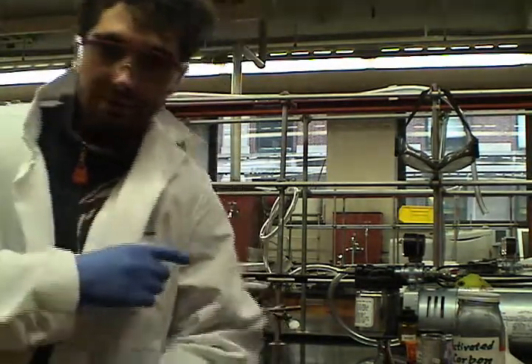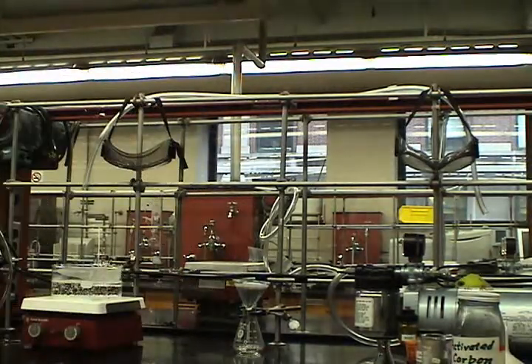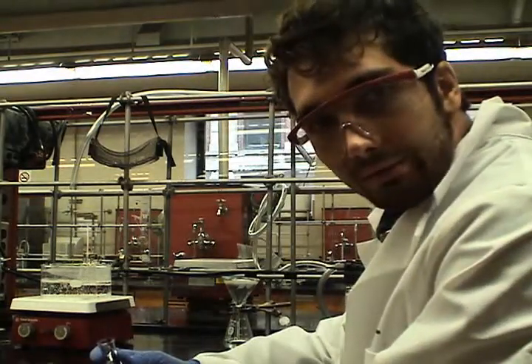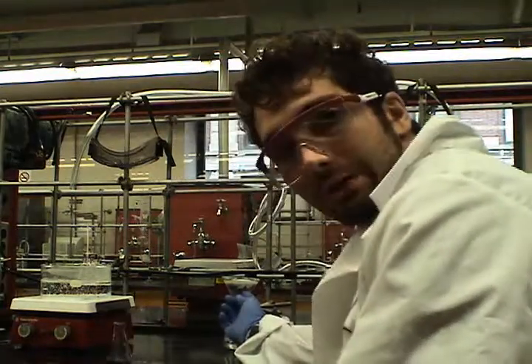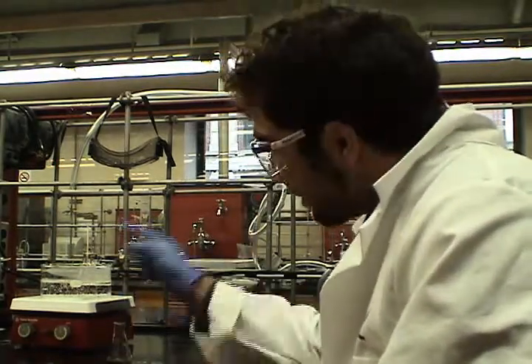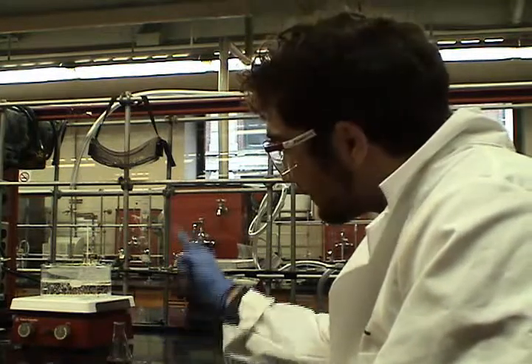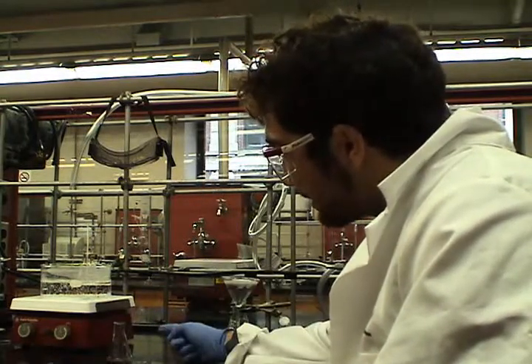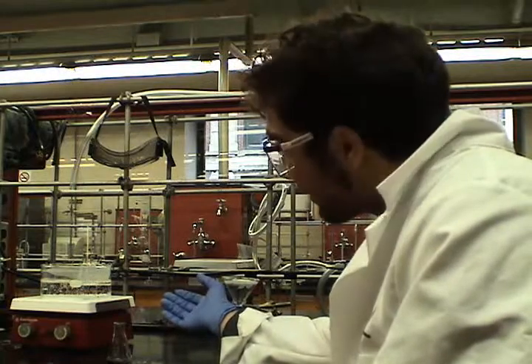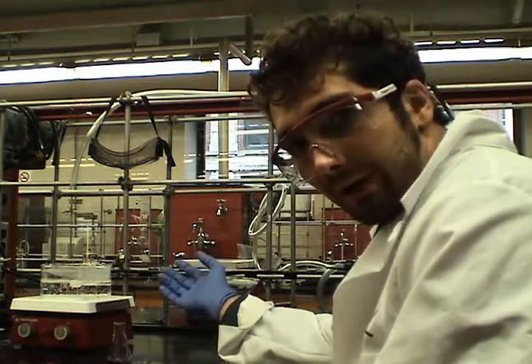I'll check back with you after this is filtered through. The initial filtration is done. The question is, where are we still losing compound? There's got to be some left over here in the original flask, and there's also a ton of compound on our filter paper. This is where the hot solvent wash comes in. Over here, I have a hot plate with a water bath on top, and clamped over that water bath is an Erlenmeyer flask full of hot ethanol.